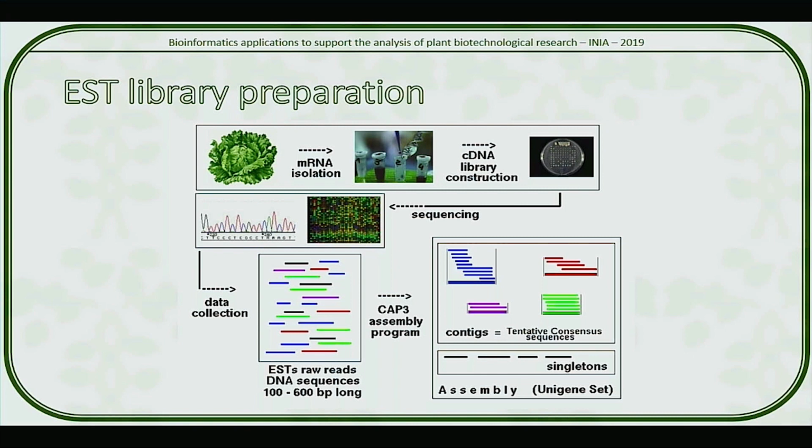Then we need to select what we're going to use from this total RNA extraction. If we want to target small RNAs or messenger RNAs, we need to first get rid of the most abundant class of RNA in any cell, ribosomal RNA. How do we get rid of that? We use ribosomal RNA depletion.